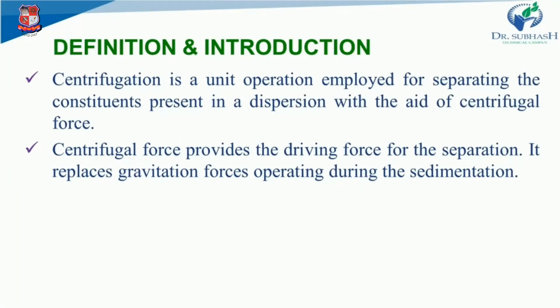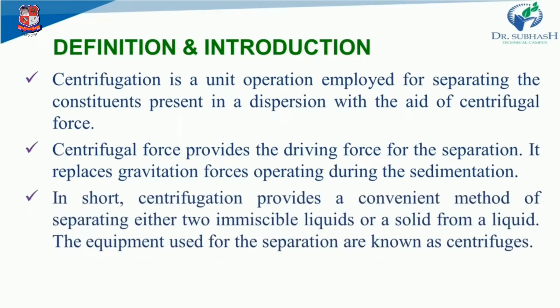You might have heard that centrifugal force is way too much stronger than gravitational force. In short, centrifugation provides a convenient method of separating either two immiscible liquids or a solid from a liquid. The equipment used for separating are known as centrifuges, right? So please remember this slide. You can pause the video to understand it yourself. Read aloud the definition so that you get a proper idea of it, right?